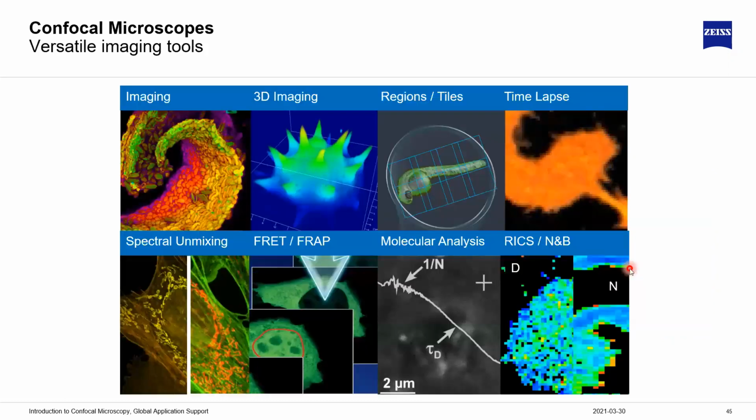With this, I would like to finish my talk. As a reminder, I put the slide that I showed you at the beginning. So all of these things that I talked about today were done just using a simple confocal microscope. There was no changing of the sample preparation. There was no changing of, let's say, embedding your sample. There is no changing of your well plates or your slides. So all of these things that I talked about today are just clicks in the software.